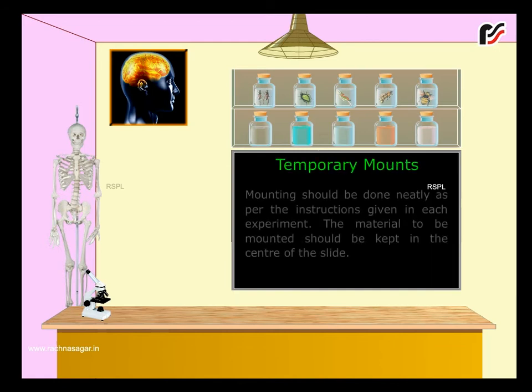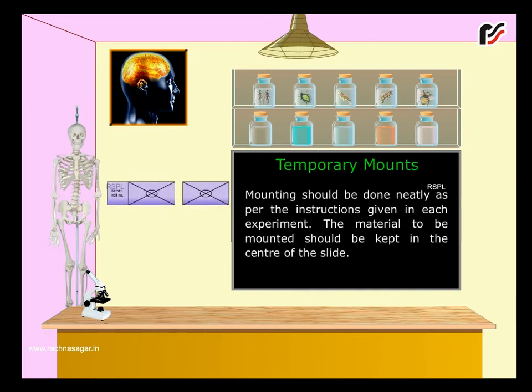Temporary mounts. Mounts should be done neatly as per the instructions given in each experiment. The material to be mounted should be kept in the center of the slide.